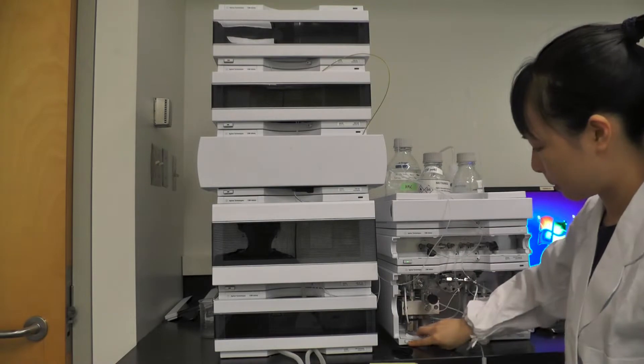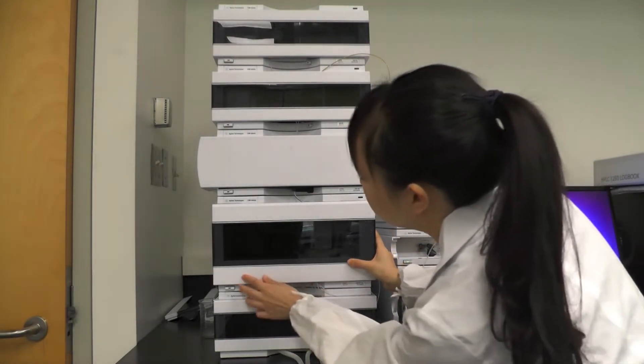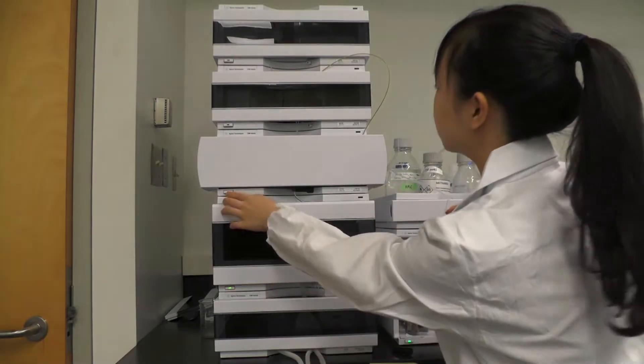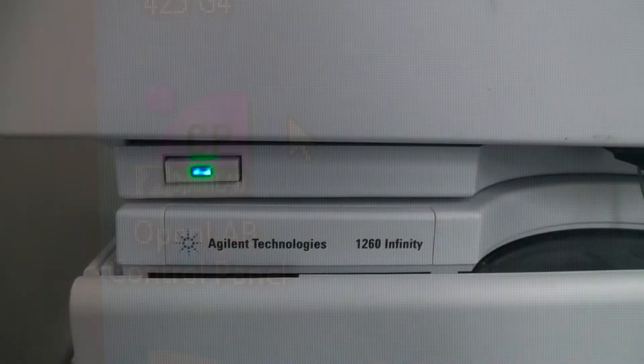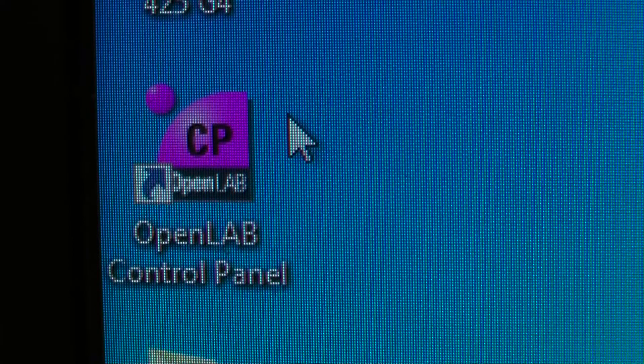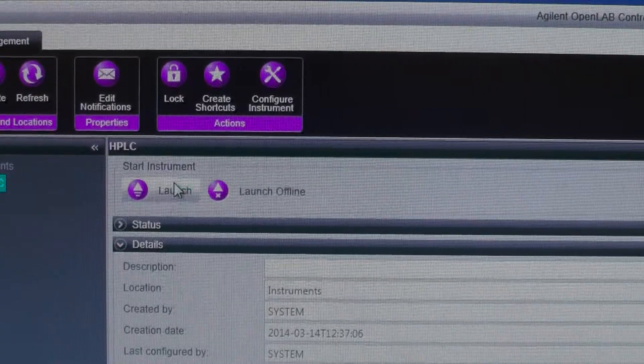Turn on all of the modules by pressing the bottom left buttons of each module. Only one detector should be turned on. Open the OpenLab control panel program on the computer, selecting launch mode.